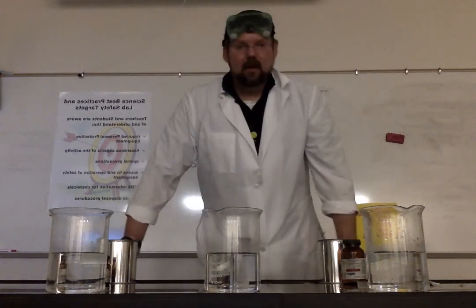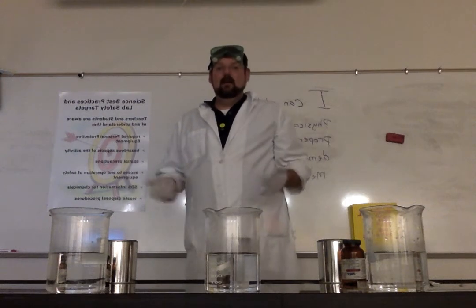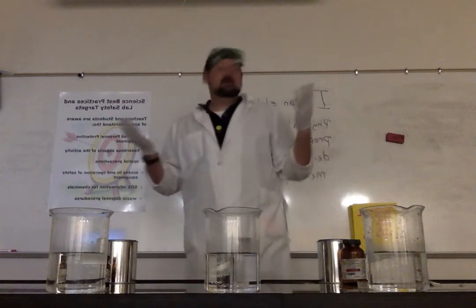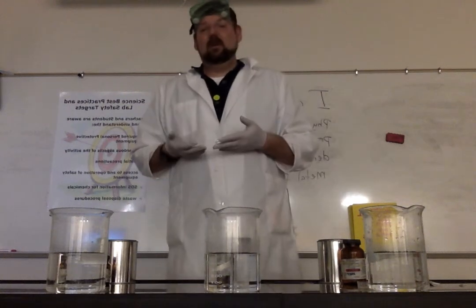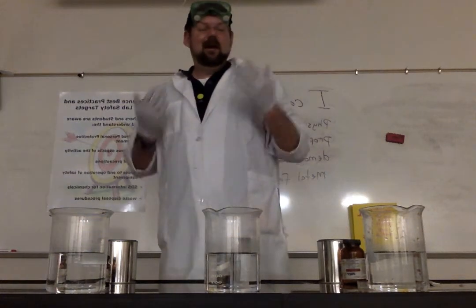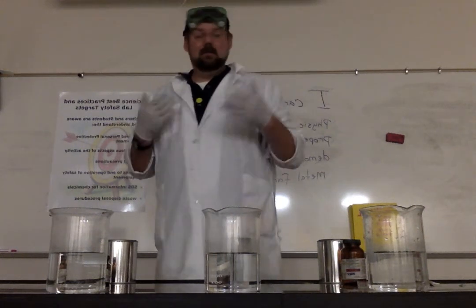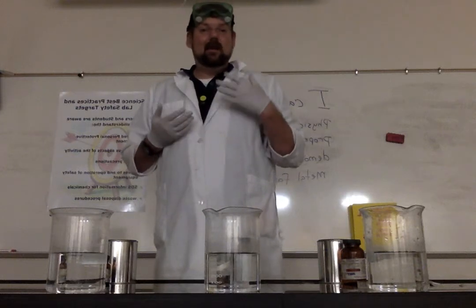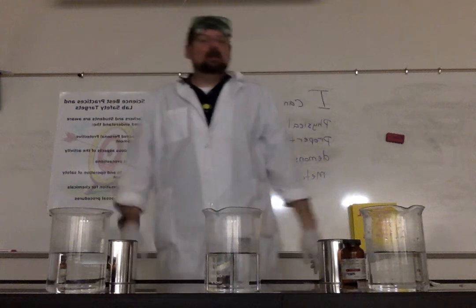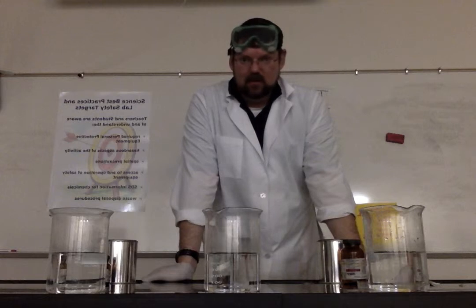Okay. Now, not only am I lab appropriate, but I have other safety equipment with me. First, for personal protection, the MSDS here told me that I need to wear gloves. It makes sense. As a human, I'm mostly water. Since I'm mostly water, and I just told you that this stuff likes to react with water, I need to make sure that my skin doesn't touch this, or else I'm going to be in a lot of trouble and not have a very good day. Same thing for my eyes. I need eye protection.